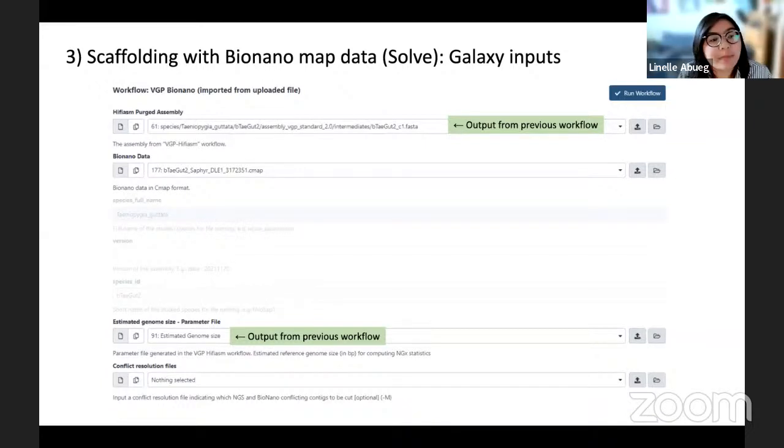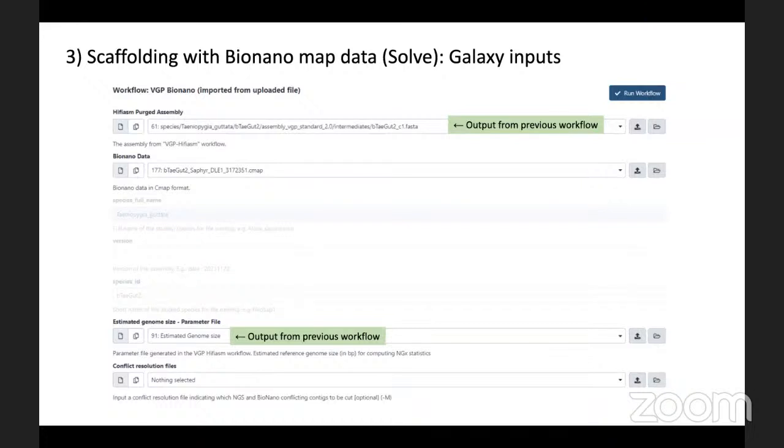Yeah, so you would upload all your data essentially once. The workflows, there are four of them: the genome profiling, hifiasm, Bionano, and Hi-C. It's modular, because for some of our assemblies, for instance, we don't have Bionano data, so we don't want to run that one all together. So it's plug and play with regard to the individual workflows. Okay, that makes sense.